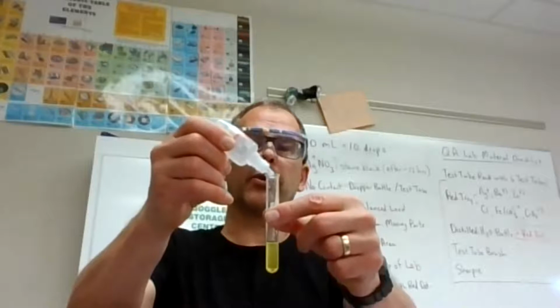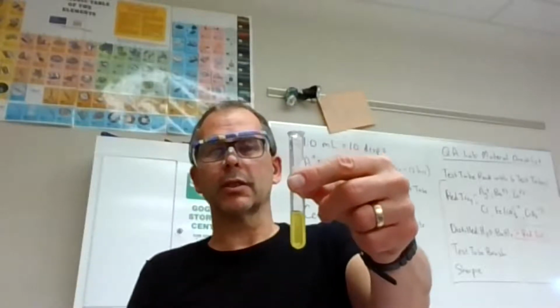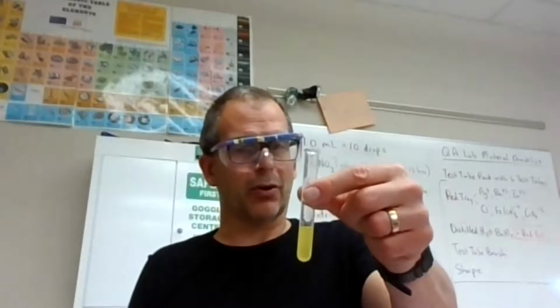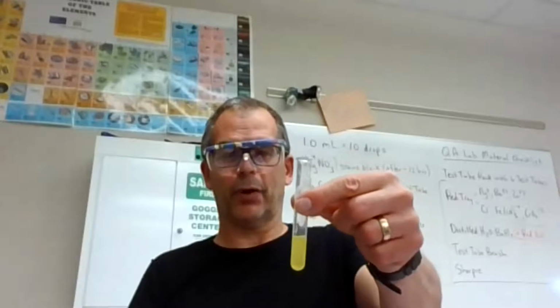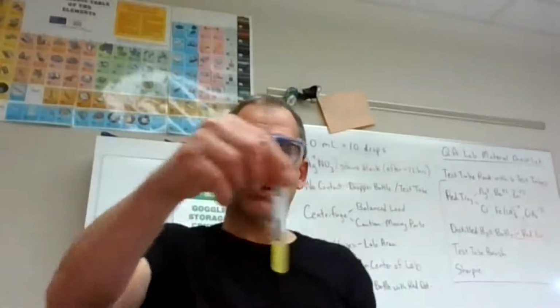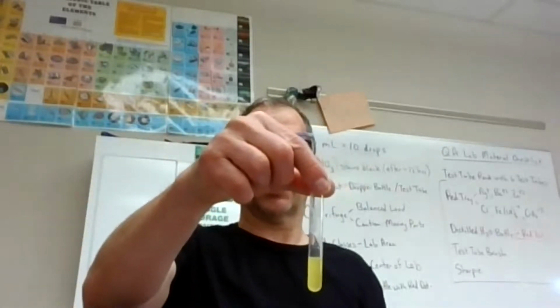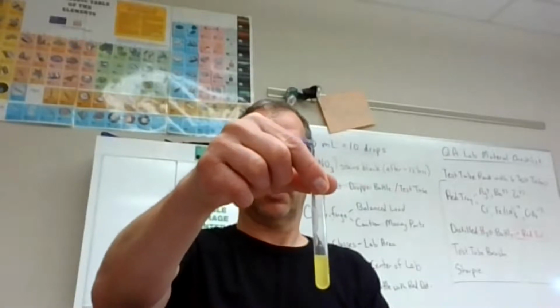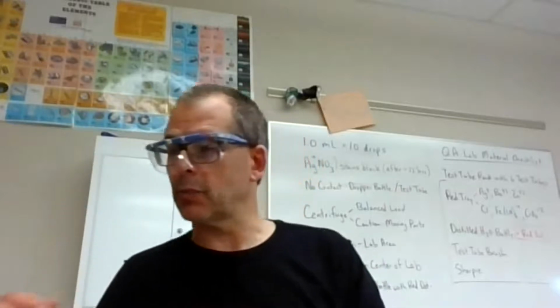This is the one where I add 3 extra drops. So this is kind of that slow forming precipitate formation. But again, I'm looking at it, and it doesn't turn cloudy right as he has the drops, but it's definitely gotten hazy after. And that is a typical positive response for the precipitate in that third step. So not looking at so much the initial drops, but does it haze up after 20, 30 seconds? And it looks quite hazy at this point.